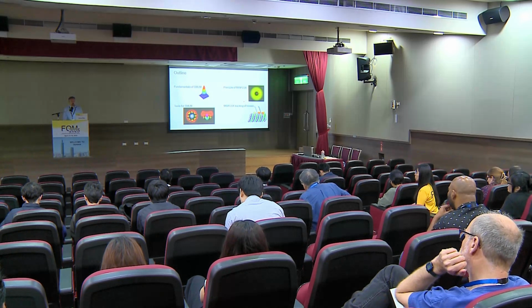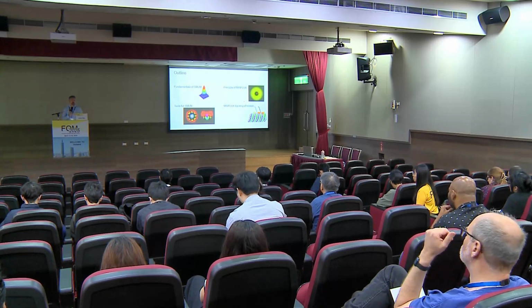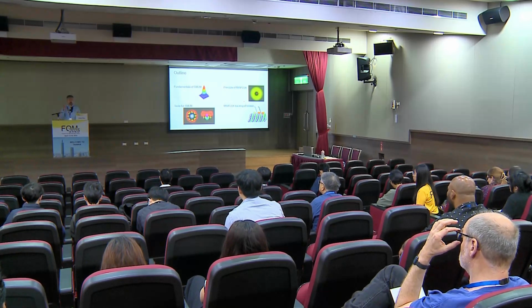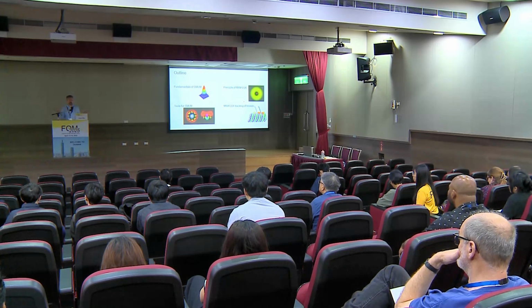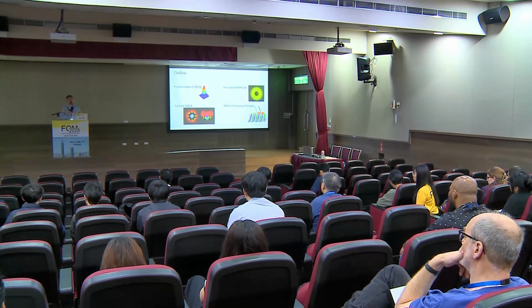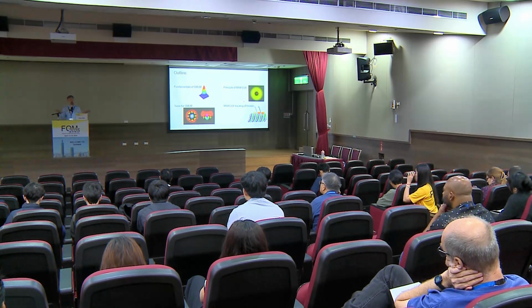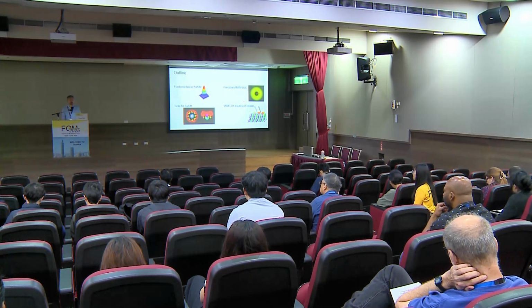So if we were to improve on this, and I think there are technical ways of doing both, we are still limited in the end by the number of photons that we can detect per second, so by the brightness of the fluorophores. Even with very high laser powers, at some point the fluorophores saturate and we might cause phototoxicity. So this is in the end the limiting factor for tracking.